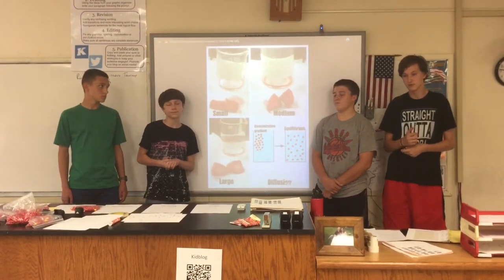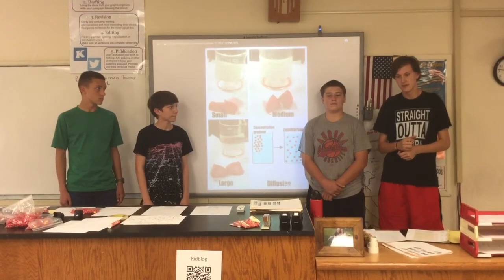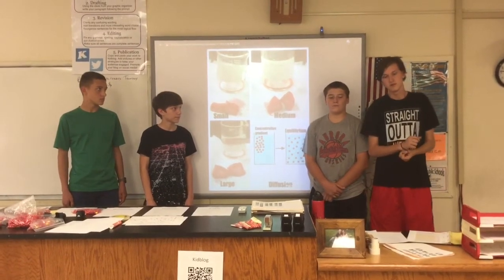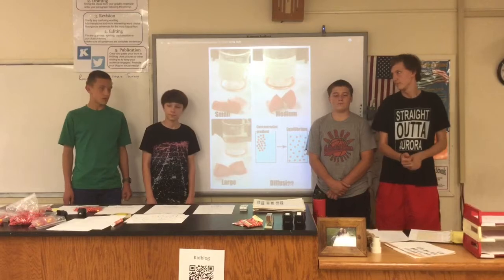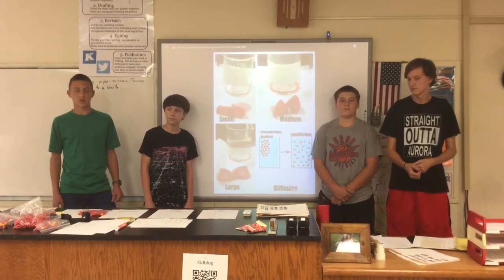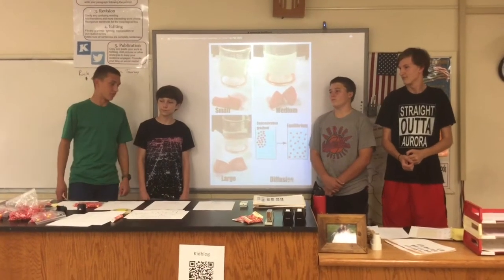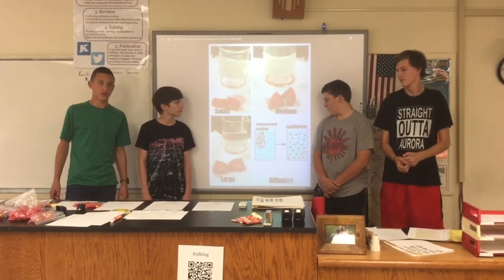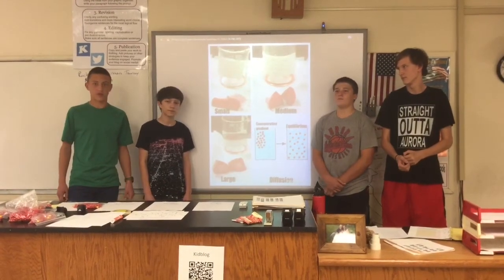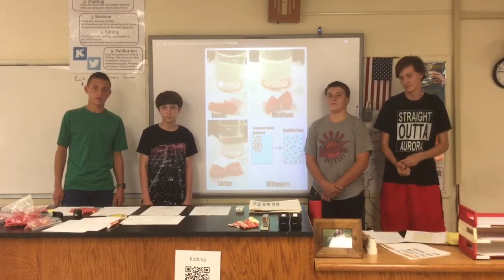In conclusion, our results were what we wanted because there was a smaller distance that made it diffuse faster. Some things we could have done differently is, one, we could have more periodically checked how fast it took to diffuse the egg, so we could have been able to tell how efficiently it diffused, or we could have cut up more different sizes of egg to see which one was the most efficient in diffusion.